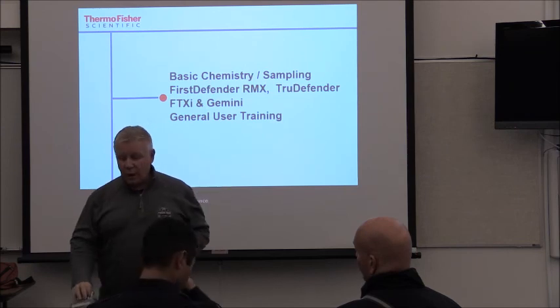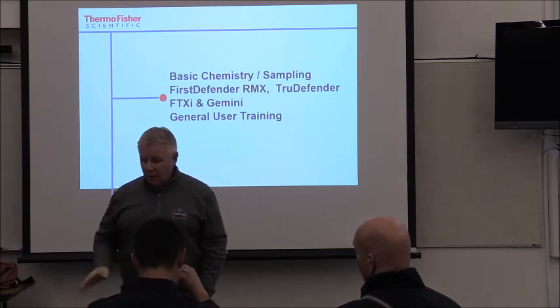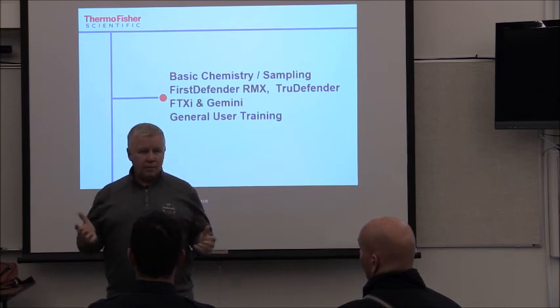The reason I point that out is a lot of times people will go down range with a device and they'll get a read. The FT said it's water, the Raman says it's hydrogen peroxide, and people will stop and say, well, which is it? It's both.